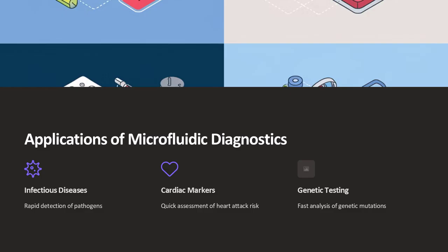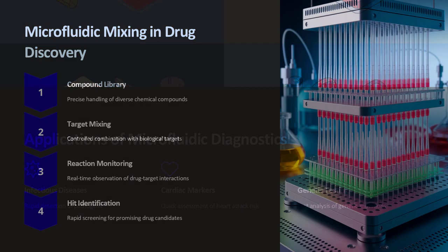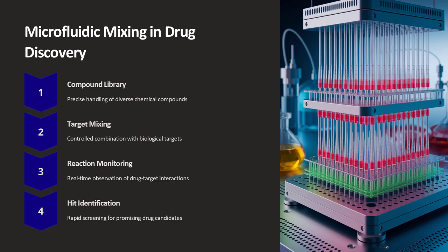These simulations can model complex interactions within the microchannels, allowing researchers to visualize flow patterns and identify potential areas for improvement. In this way, the iterative cycle of design, simulation, fabrication, and testing is accelerated, driving innovation in microfluidic mixing.